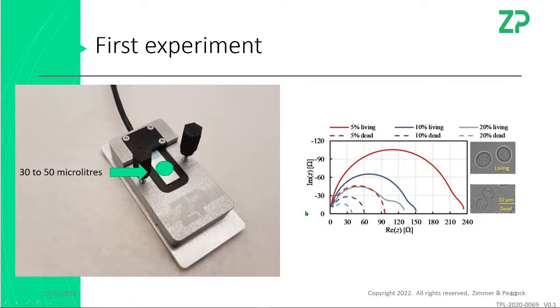The reason I'm suggesting this is because it's much simpler to be doing this experiment than to do an experiment where you're trying to do it in a microfluidic chamber. You know, it's kind of adding a new degree of complexity. So I would actually just start off simple.